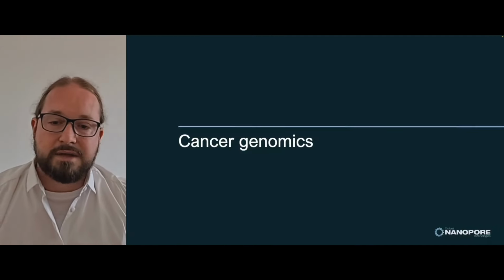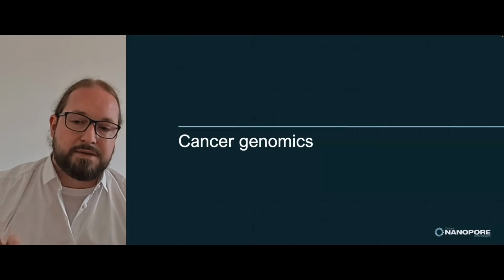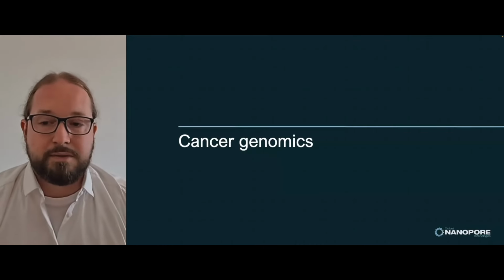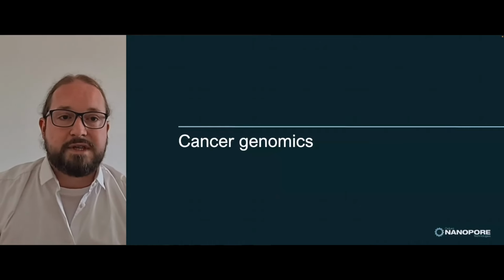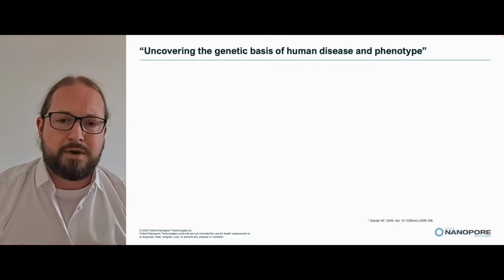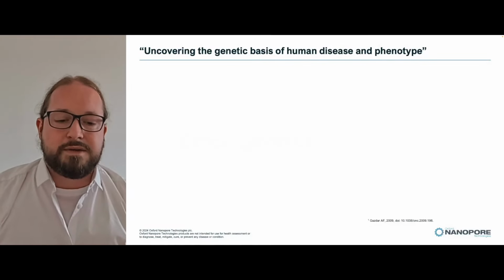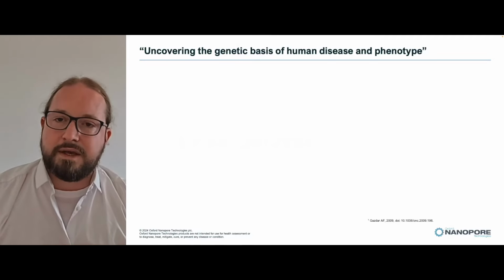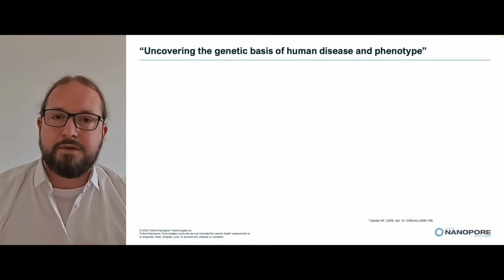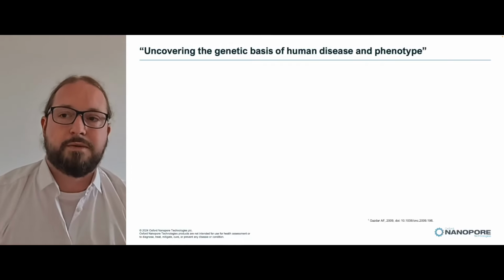And so for the last 5 minutes or so, I just want to give you, as I said, a brief glimpse into cancer genomics and single cell. So let's start by cancer genomics. Cancer, in a sense, obviously is a very complex disease. There are many hallmarks of cancer, for example, genomic instability, and there are many changes a cell has to undergo before it turns into a cancer cell line. So basically, a complete view of all different types of genetic and epigenetic variation is incredibly important in cancer.